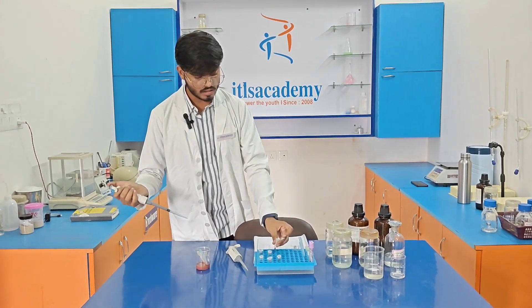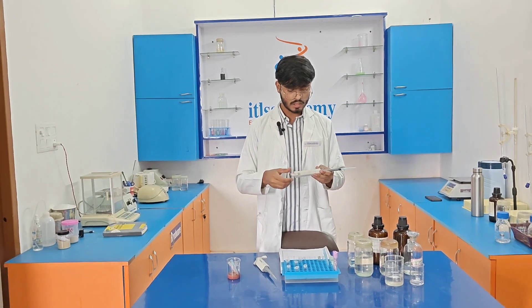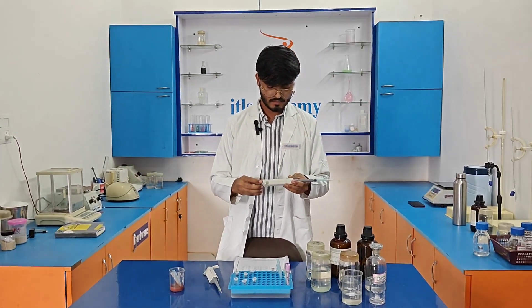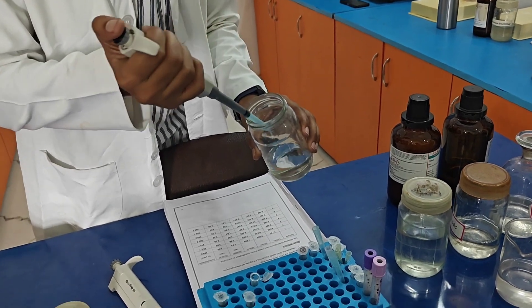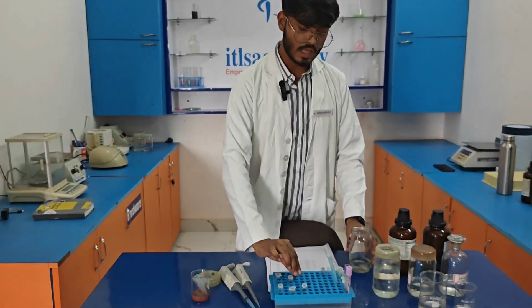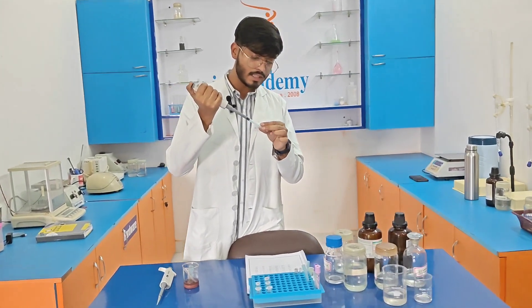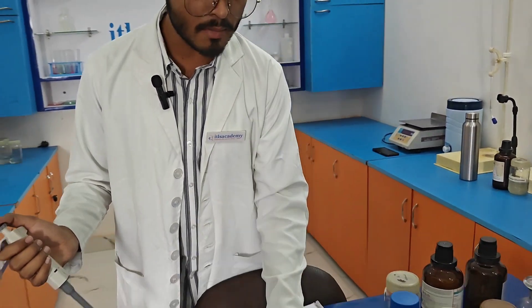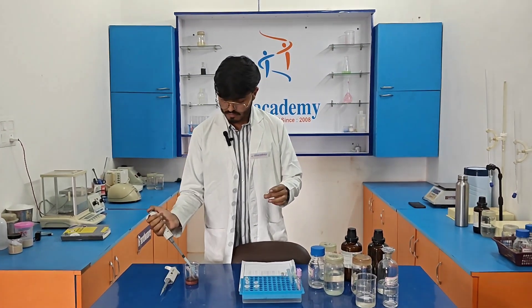After discarding the supernatant, we need to add 70% ethanol, also 100 µl. After performing the centrifugation, we need to discard the supernatant and then air dry the pellets so that the ethanol smell evaporates. After that, we need to add Tris buffer.